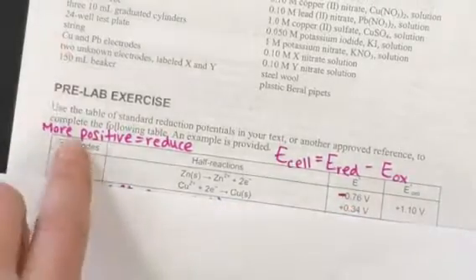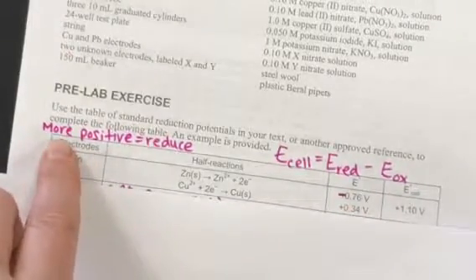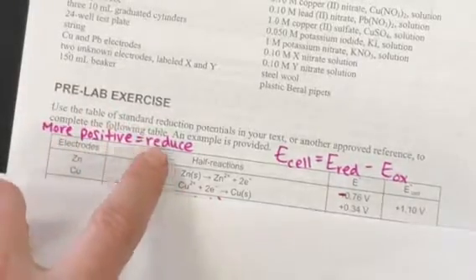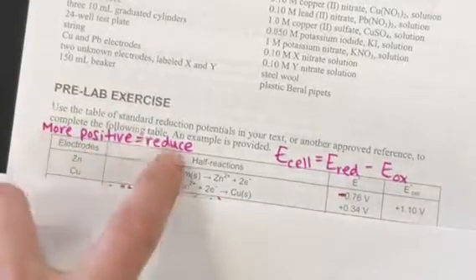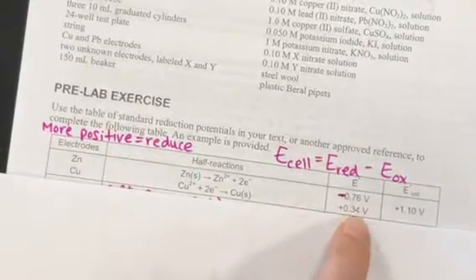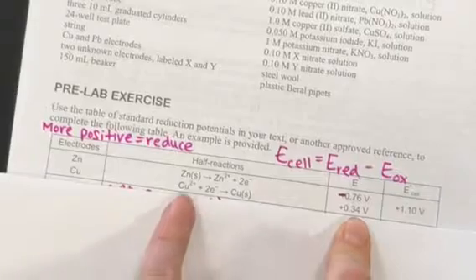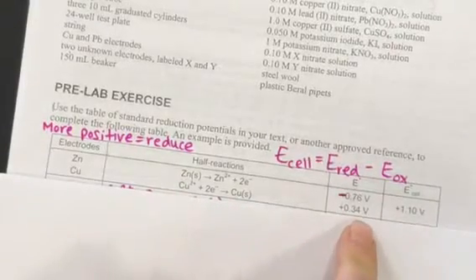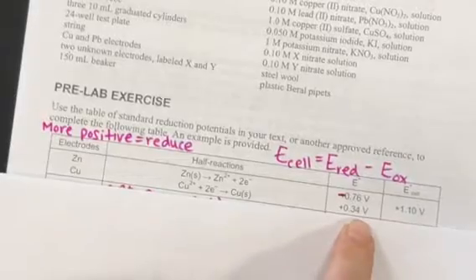So you have a more positive one, and it is more likely to be reduced. So if it is reduced, it is going to be the more positive one. In this case, we're going to keep Cu2+ and Cu solid as the positive way. That's the one that's going to reduce.